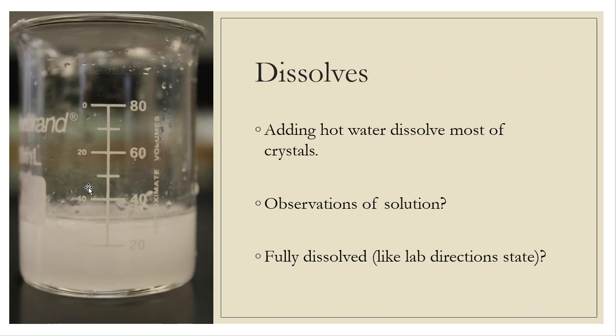It did dissolve most of the crystals, but here's the observations of that solution that you can take away. The lab directions said fully dissolved. Okay, and I'm not happy with this. What I'm looking at right now is a cloudy solution that's down here, and I'm not going to say that's fully dissolved. I think that we can do a little bit better than that.